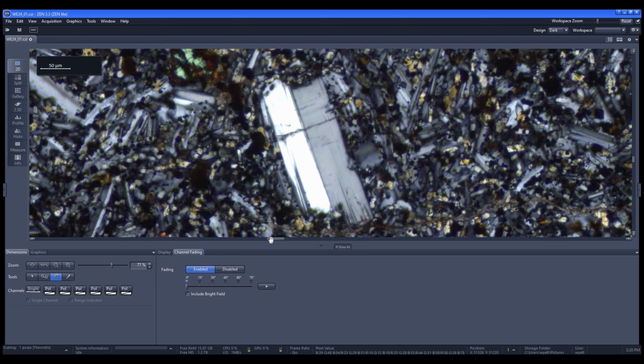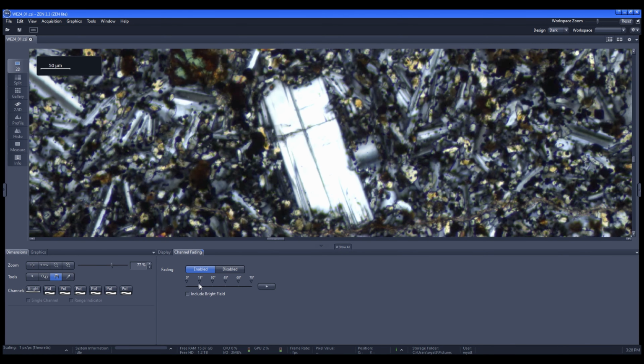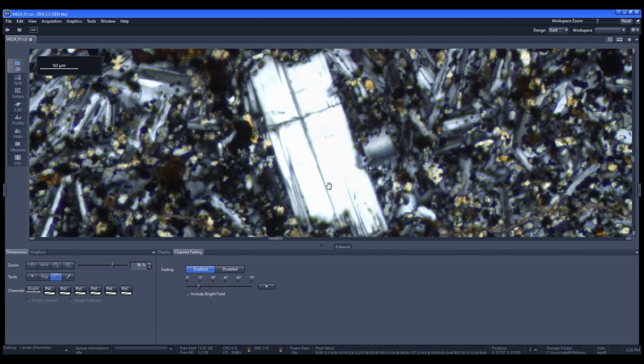If you use this specific graph, let's say I'm rotating my microscope. Again, this would be easier on a microscope. You can see right about here, both sides of that center twinning line are about equally white. That's where my starting place would be. That looks like about 14 degrees.